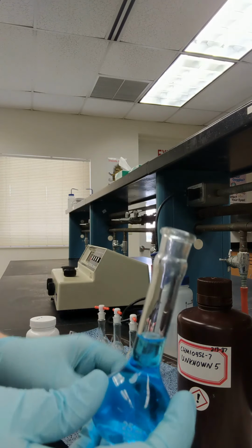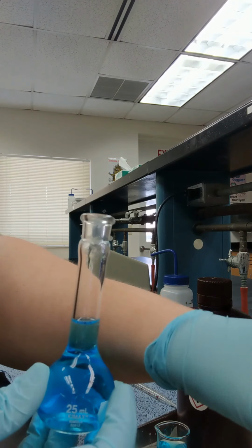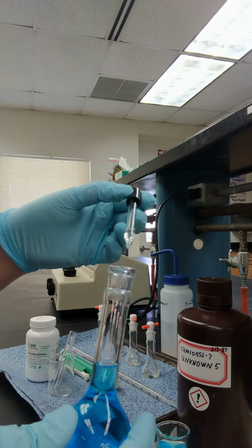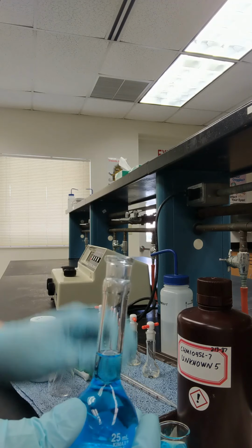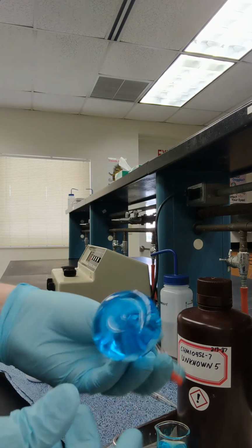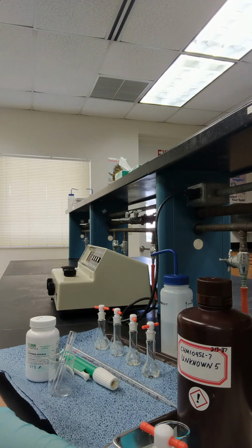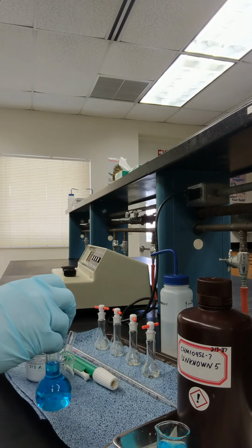So instead of adding the water straight from the distilled water bottle, once the volume is very close to that line, we should add drop by drop to make sure that we get exactly to the line of 25 milliliters. So my stock solution is ready. The next step is to prepare my dilutions here.